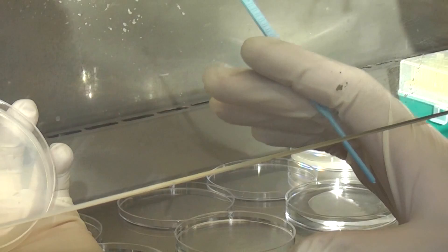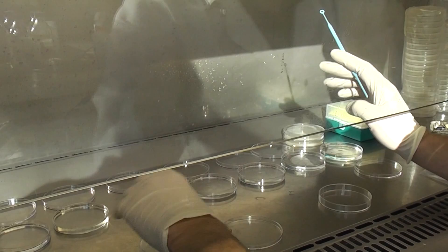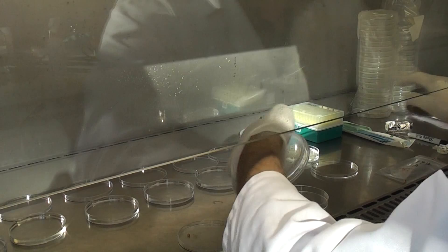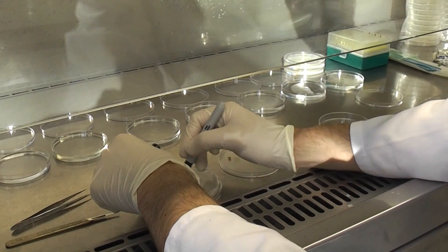Now all I need to do is seal this plate and I just label it. So that's a special code that I've got. This nodule actually came from Arthur's Pass originally.